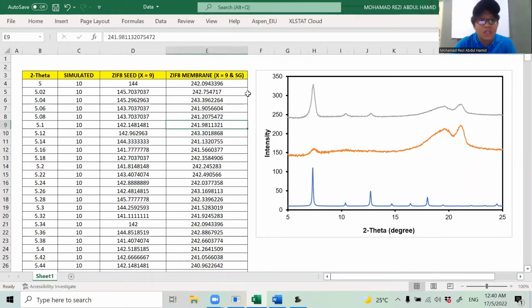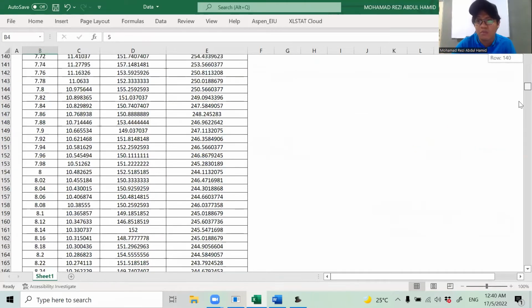As you can see here, normally when you use Excel, the default font is Calibri, but I personally prefer Arial or maybe Trebuchet MS for my plot, because it's clear and kind of roundish, or even sans serif is better. But I don't really recommend you use Times New Roman for your plot, because it doesn't look quite nice in my opinion.